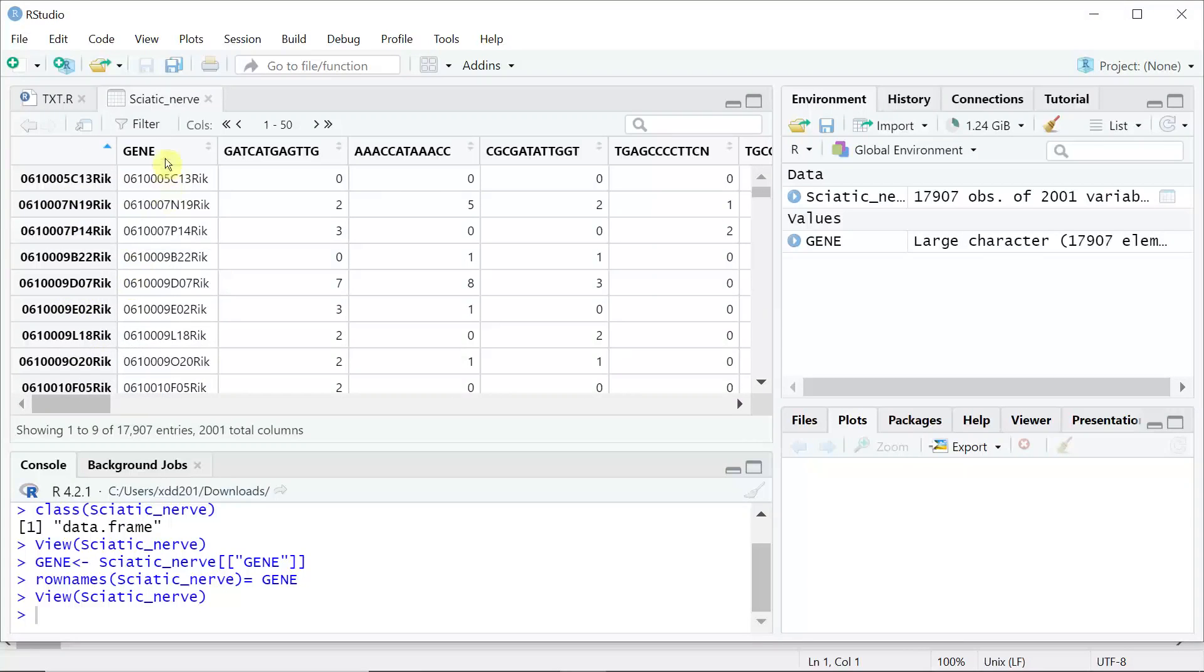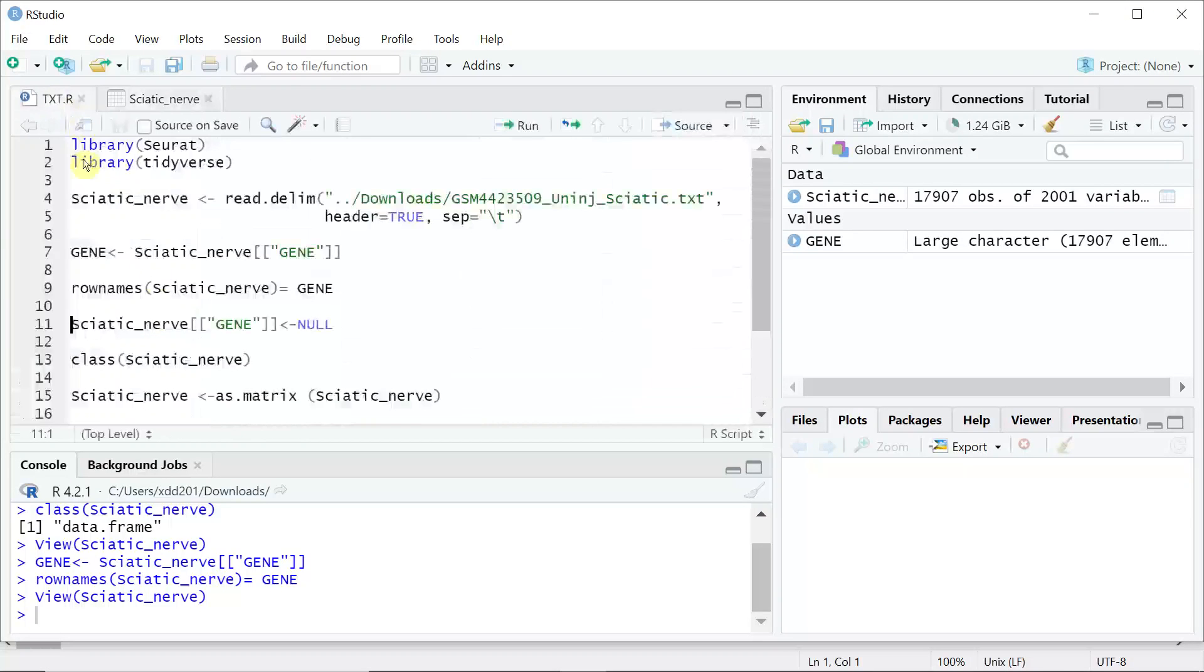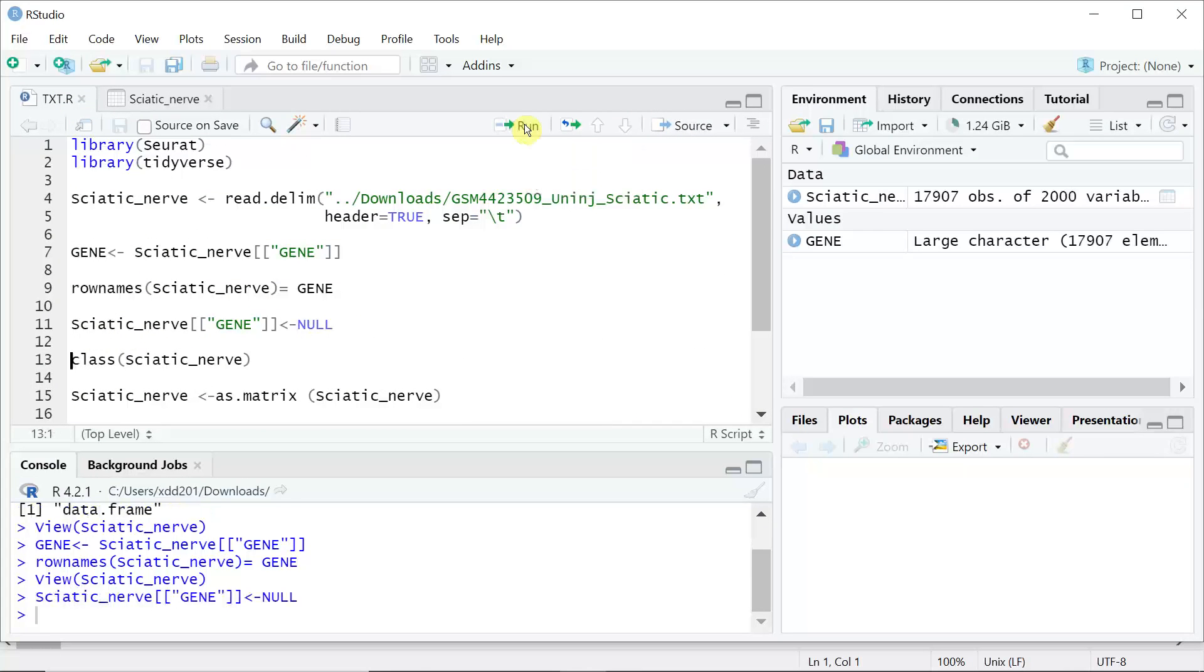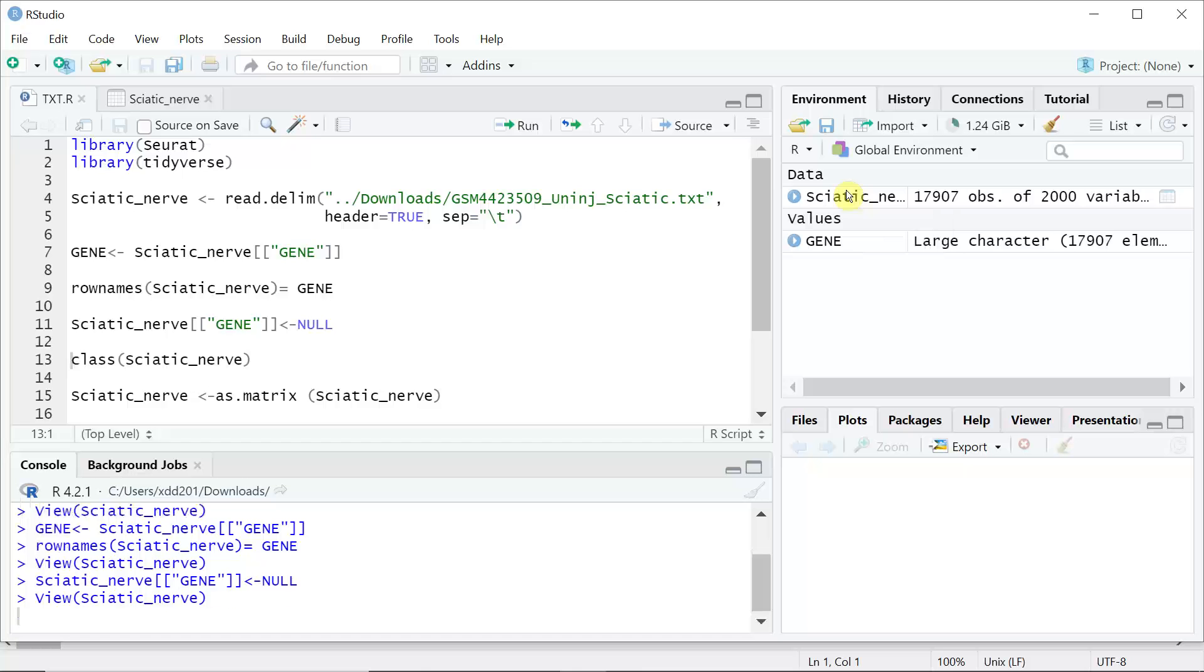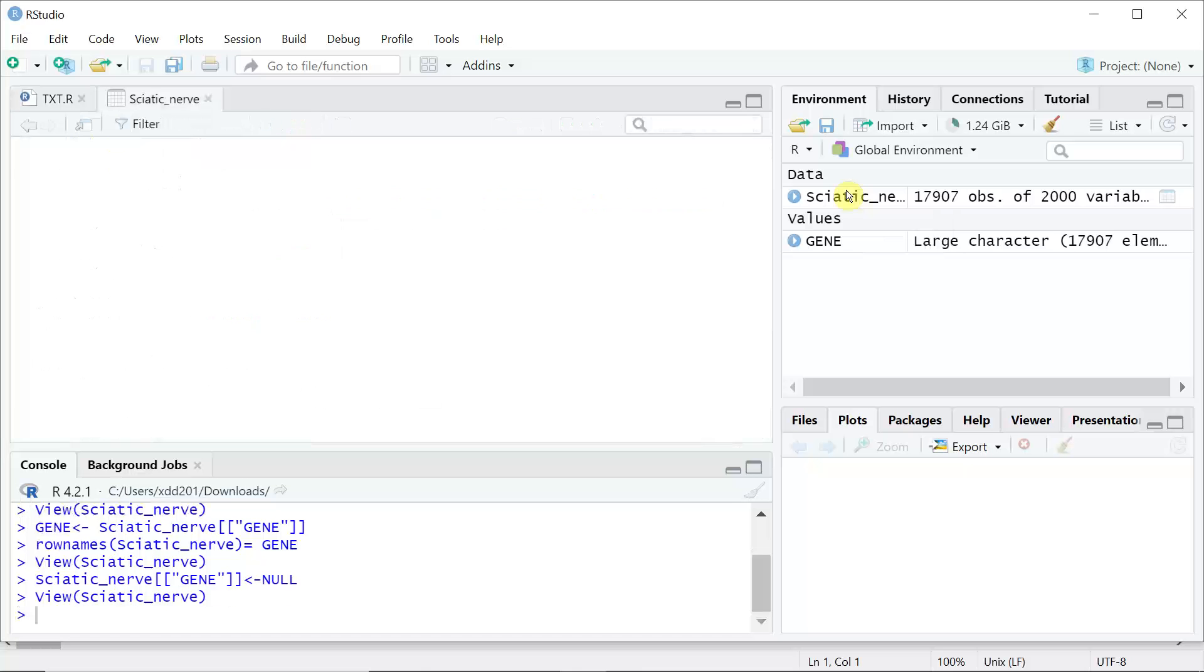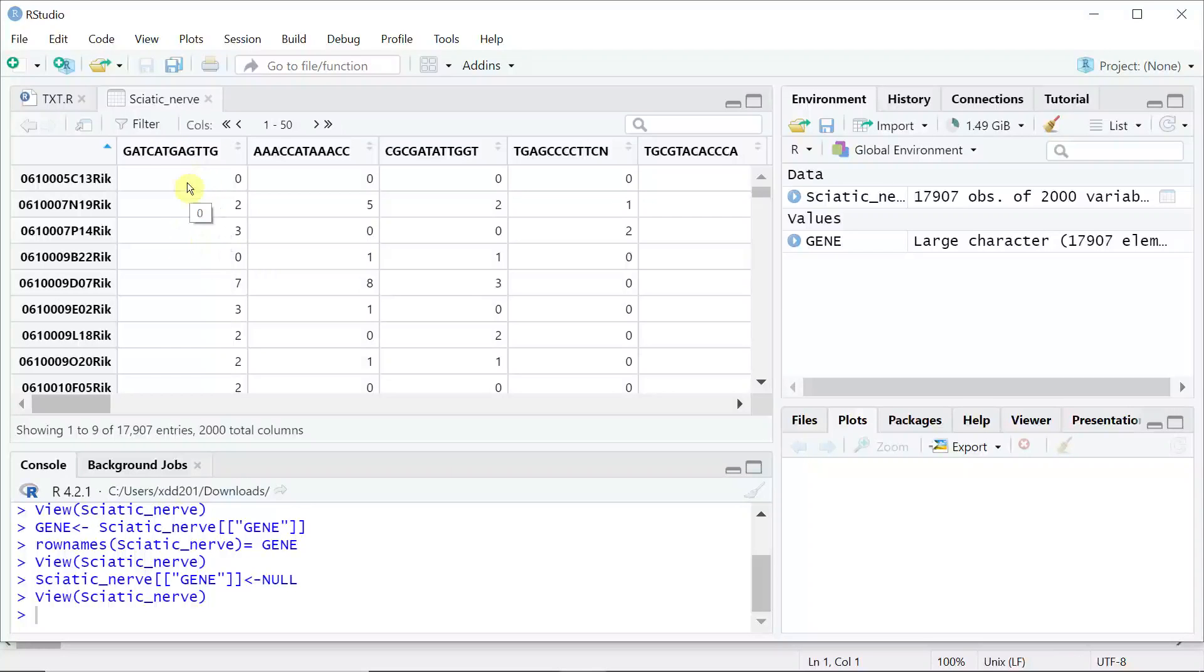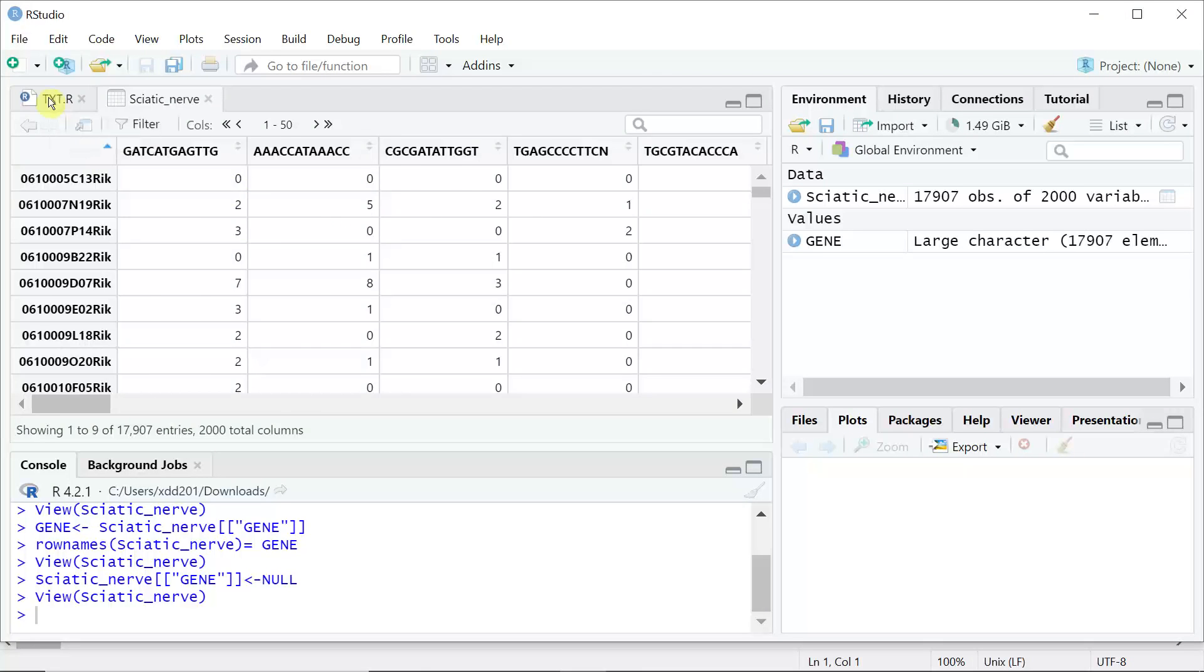But we still have the genes in column 1, so we need to delete gene names in column 1. Let's have a look at the data frame again. You can see the first column is not a gene anymore. We created a proper data frame.